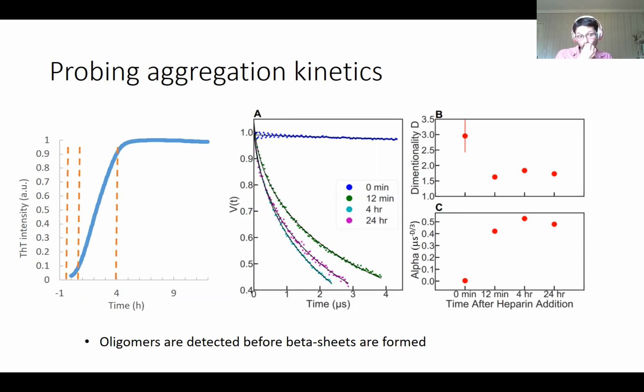Yeah, you're right. That's a good idea. And in principle, with the relaxation, it's not a stretched exponential. You could use a regular exponential and fit more of those exponentials into the signal. I know it comes from different phenomena, but with some assumptions, potentially you could fit two species contributing to relaxation. I don't know if that's well, but I get the point. I think it's good.